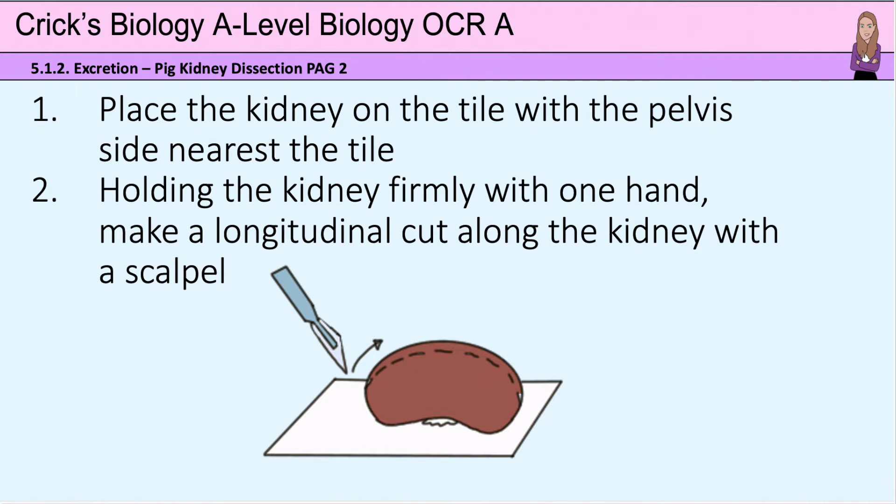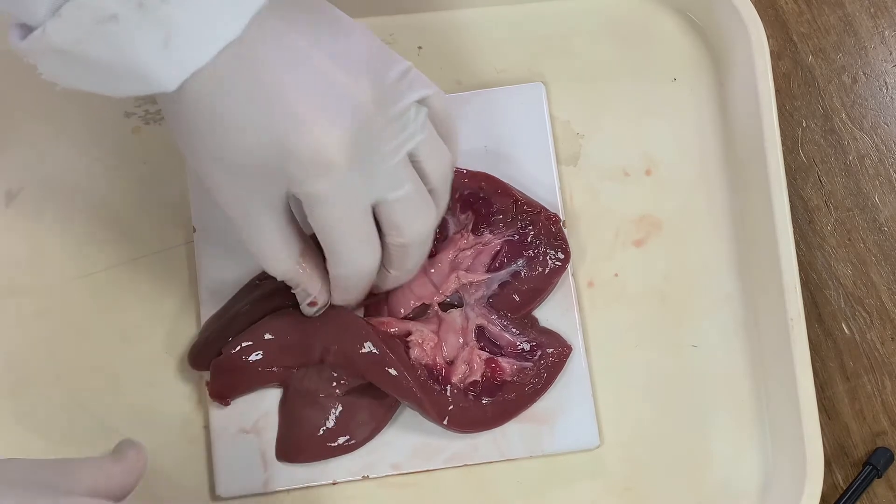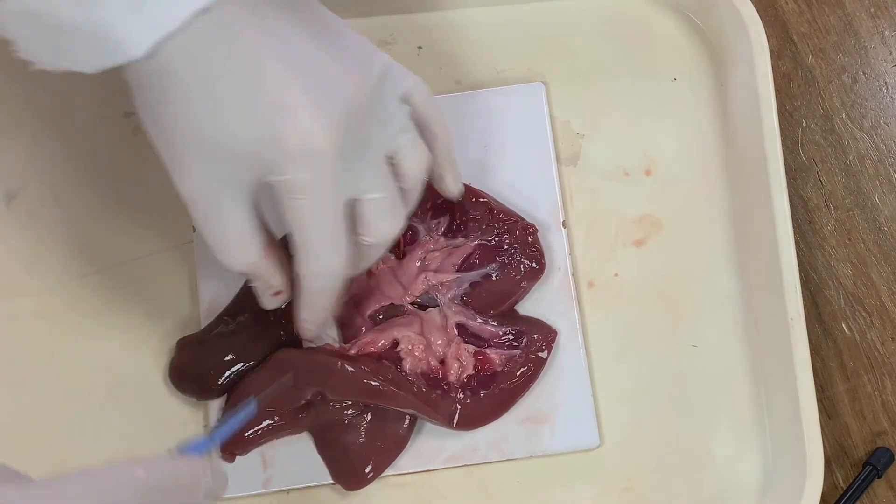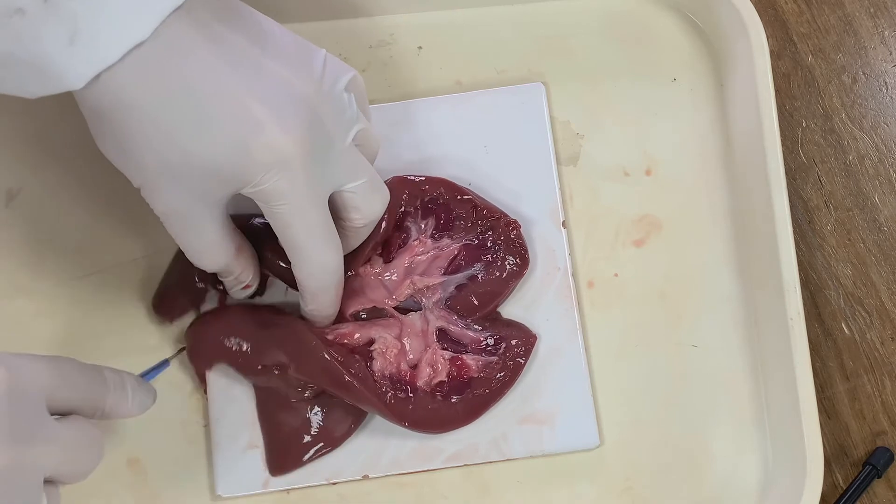To start the dissection, place the kidney on a tile or dissection board with the pelvis side down. Holding the kidney firmly with one hand, make a longitudinal cut along the kidney with a sharp scalpel. This will take time and will take many slices to get through the kidney.